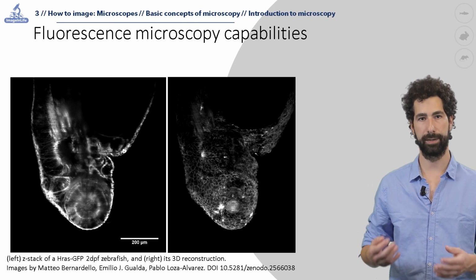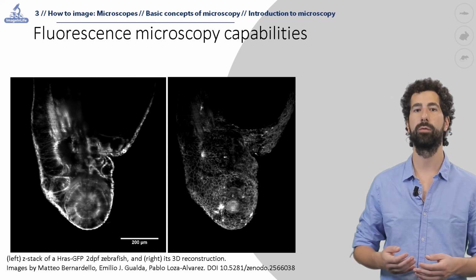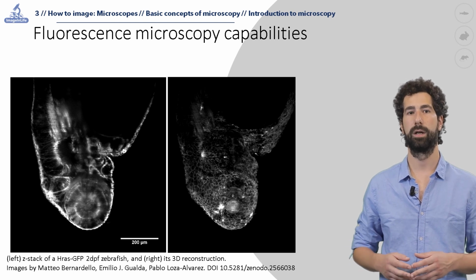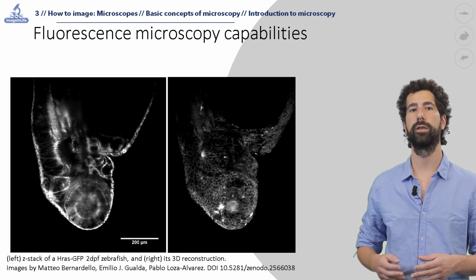As we will see in the next lectures, some microscopy techniques also permit to retrieve the position of the fluorophore in depth, enabling what is called optical sectioning. This permits to create a sequence of sections of our specimen called a Z-stack and allows its 3D reconstruction, as we can see in the right image.